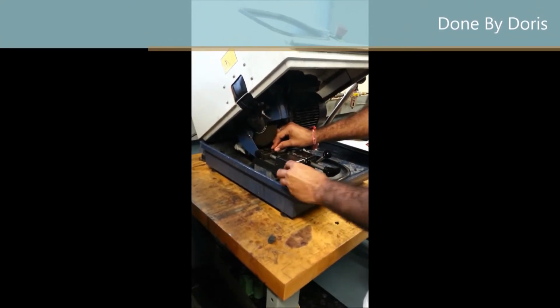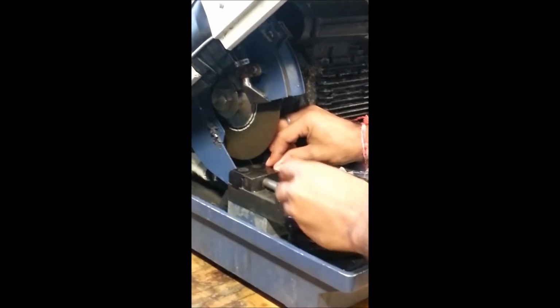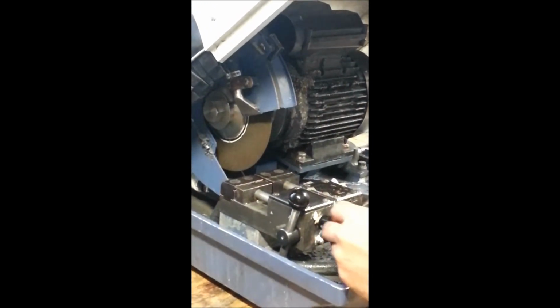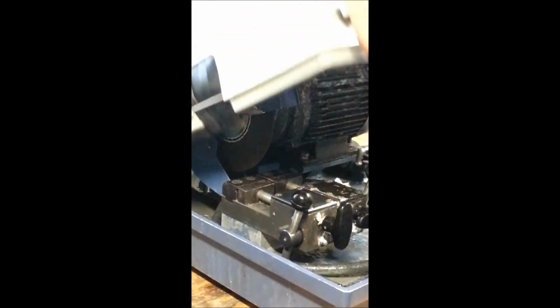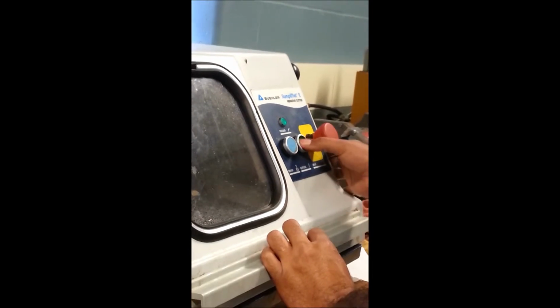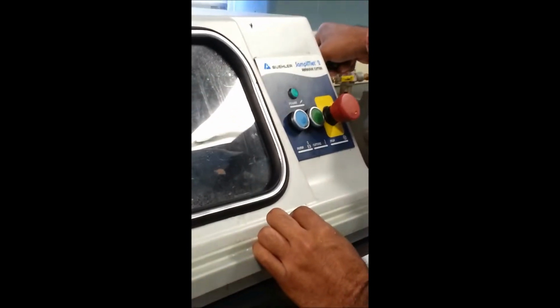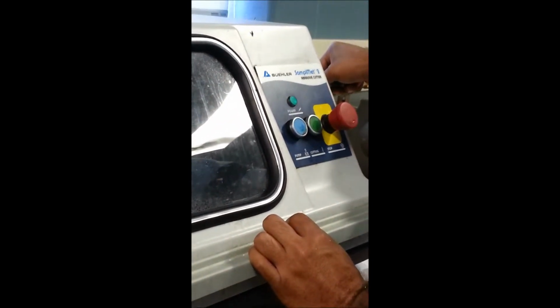The sample broken from the UTS tester was taken to the cutter for cutting because we need the shiny smooth surface later. So the broken part is placed in the cutter very carefully. The part is then tightened. Then we place the cover over the cutter because sharp cutting pieces can fly out. Coolant is also used while cutting in order to cool down the heat generated by the cutter.